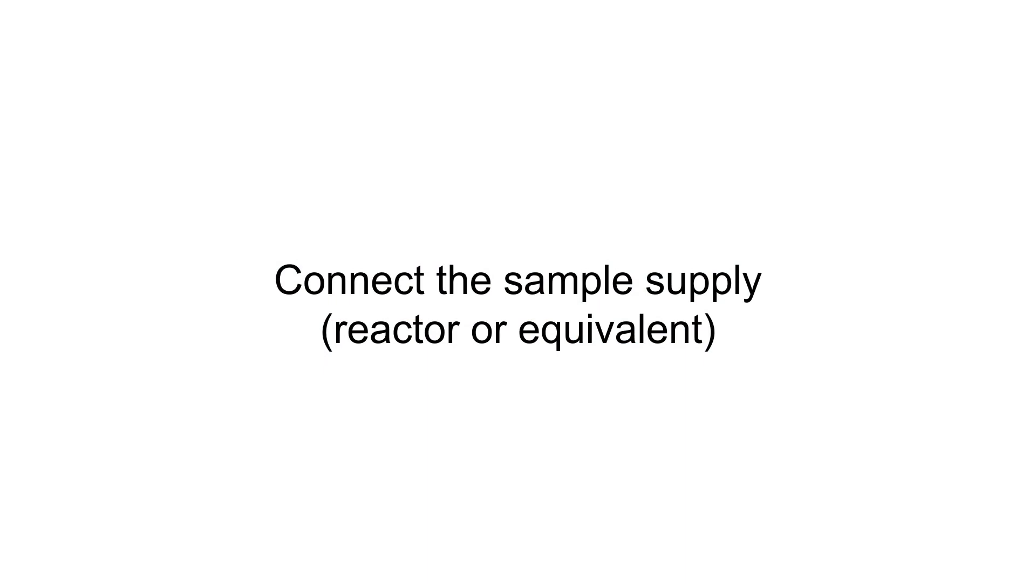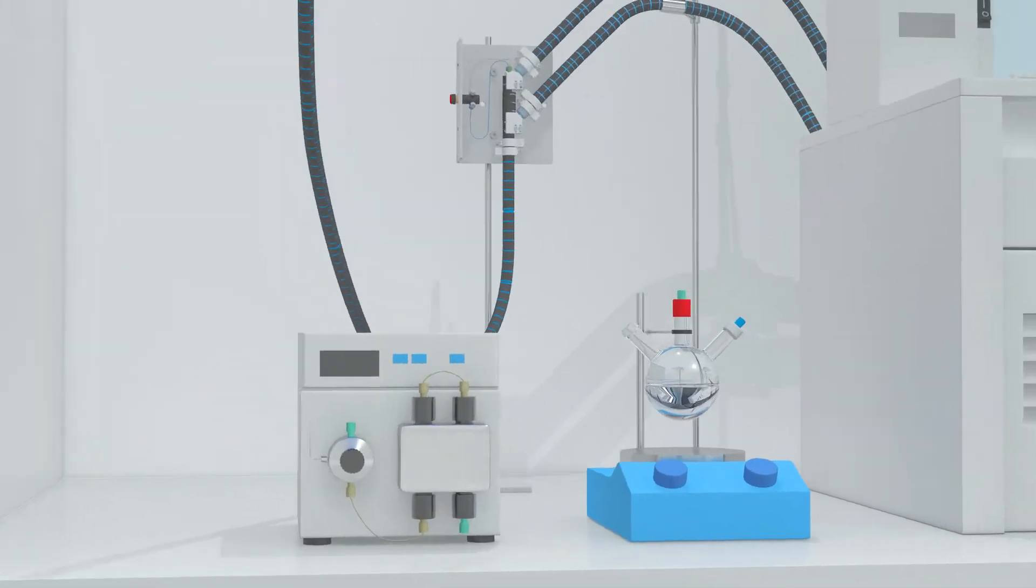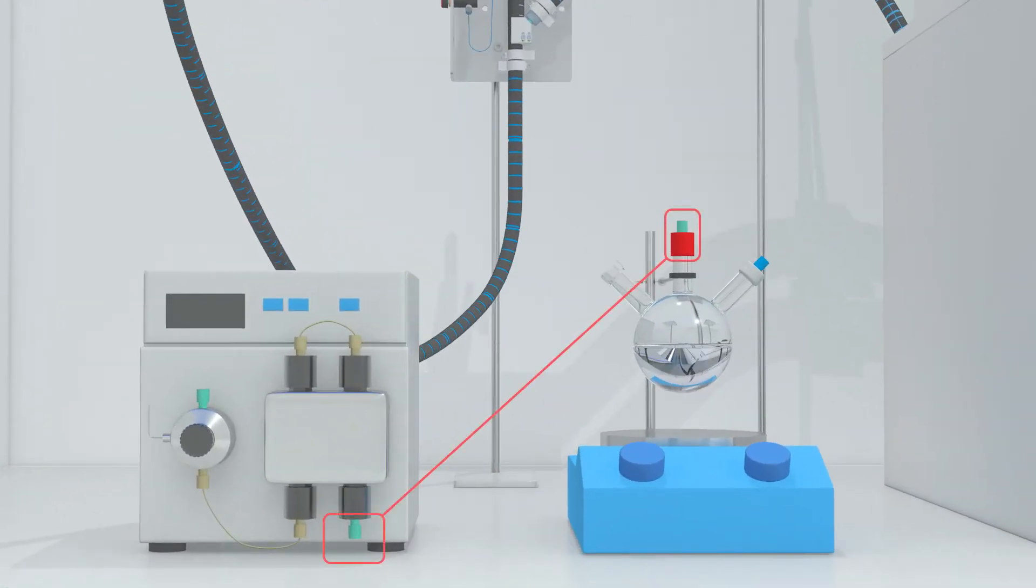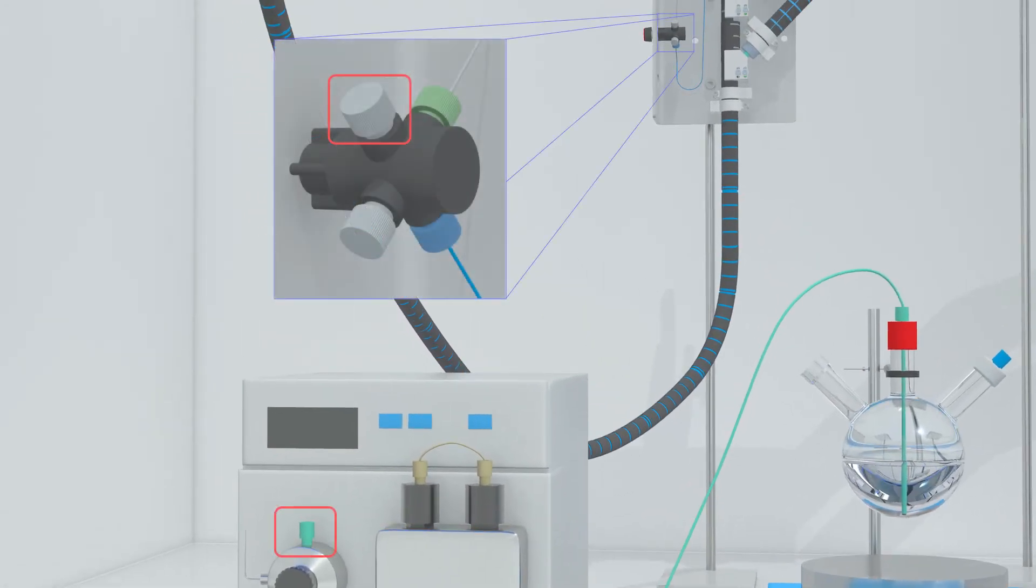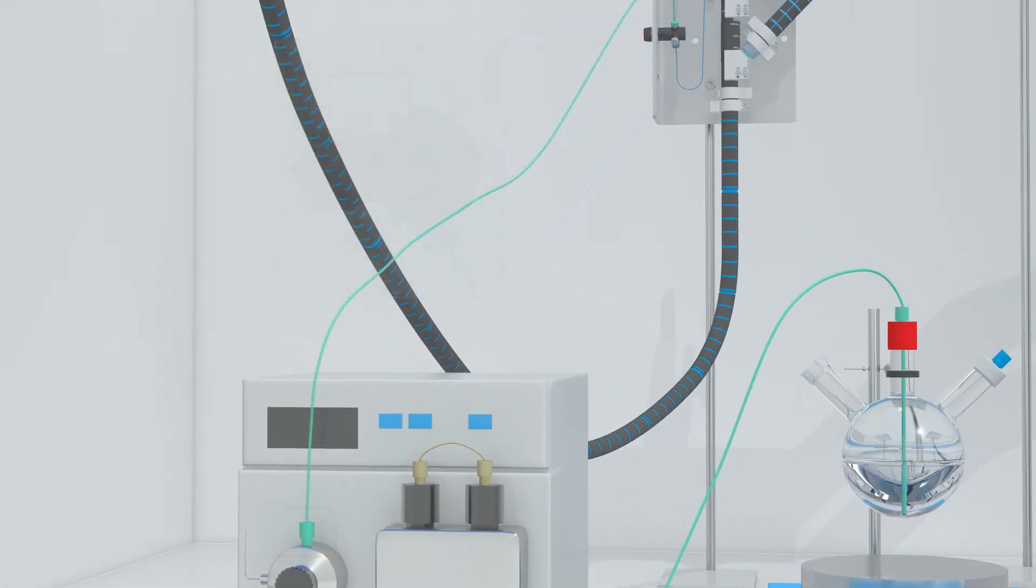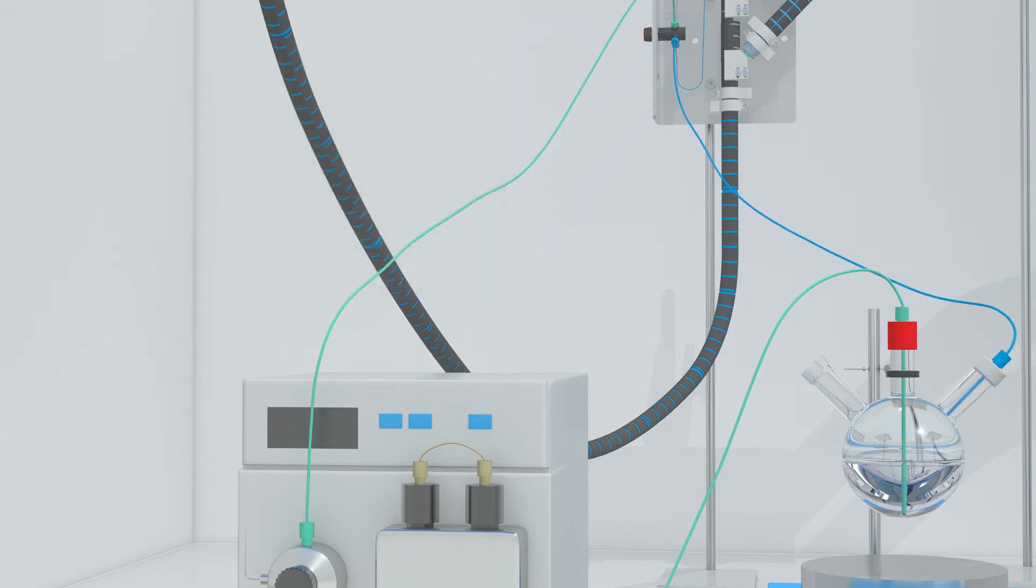Now we start to connect the various system components. Connect the sample supply to the pump, and the pump to the inlet of the flow interface, both shown here in green. Then connect the outlet from the flow interface valve back to the sample supply or to waste, shown here in blue.